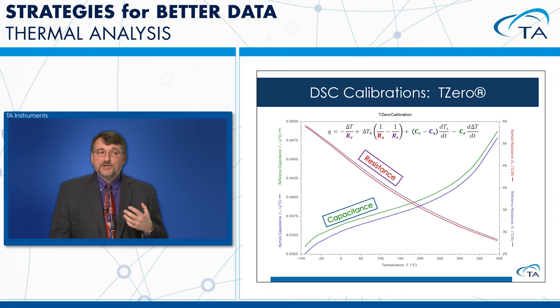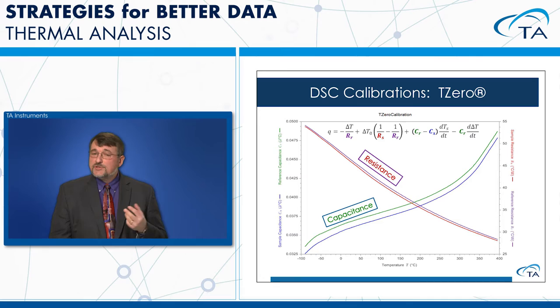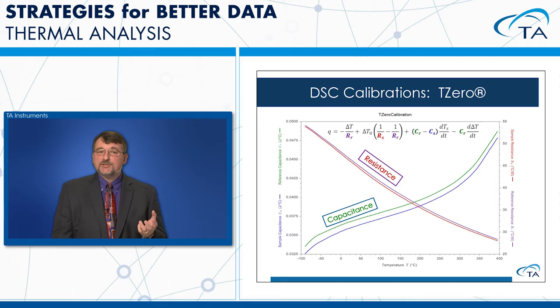When we plot the resistance and capacitance from the T0 calibration, resistance should decrease with increasing temperature and capacitance should increase with increasing temperature. The resistances should be close together, as should the capacitances, but they don't have to be exactly the same — we're now measuring what they are rather than assuming. The key thing is that we don't see any transitions or peaks; the curves should go up or down smoothly.